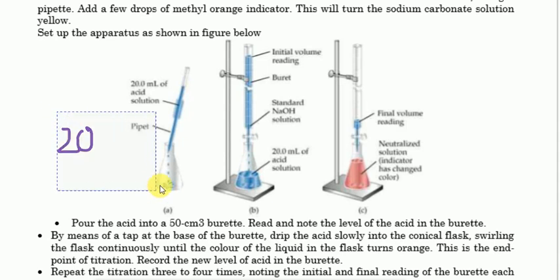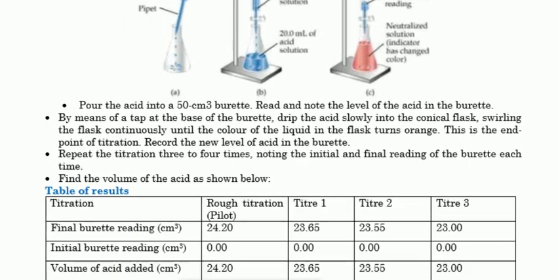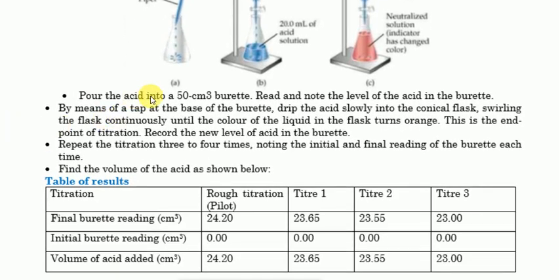Kuanzia kwenye 0 ni vizuri tu kwa mtu ambaye una experience sana, lakini kama mimi nafanya experiment, I am starting anywhere, and that will not be the reason for me to fail my exam. I hope umeelewa sana hapo kusoma volume. Toka hapo sasa tunachokisema ni kwamba pour the acid into the 50 cm cube burette.